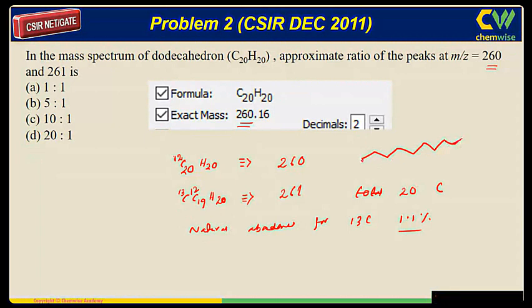So now this is 13C. One situation will arise where this will be 13C, this will be 13C, this will be 13C. So there is a possibility of each carbon individually becoming 13C. So what is the probability? The total probability is, we have 20 carbon, and we have to multiply by natural abundance. That's why the true ratio will come out. So the probability of each carbon individually becoming 13C for the whole 20 carbon system is 22.